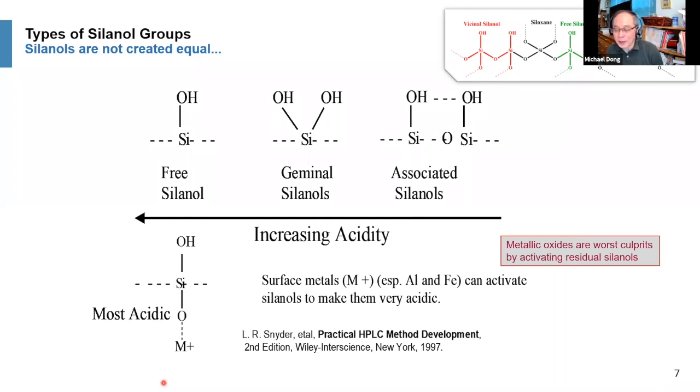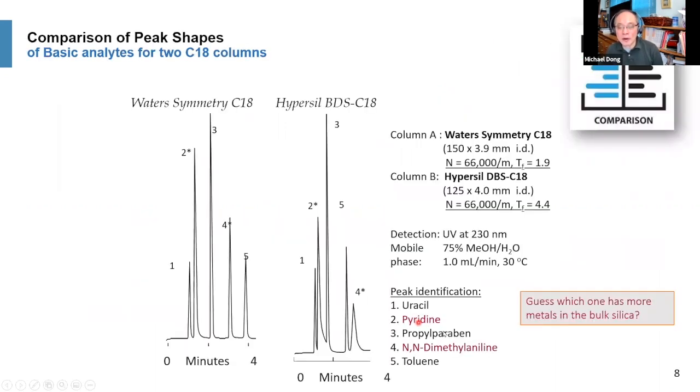So silica with a lot of metallic oxide becomes very strong, and they used that all the time. But it is not good for anything basic because you have acid-base interaction. Okay, so this is really what makes things really bad and not very reproducible.